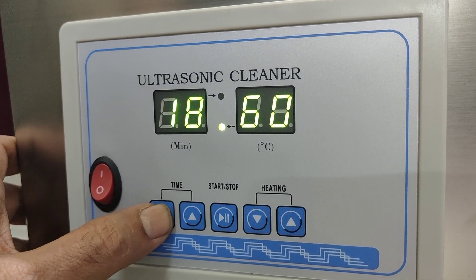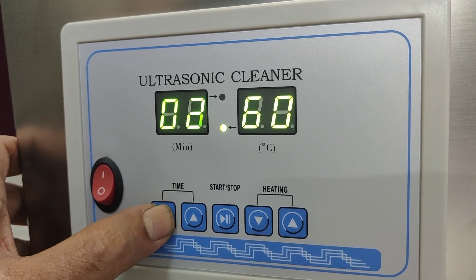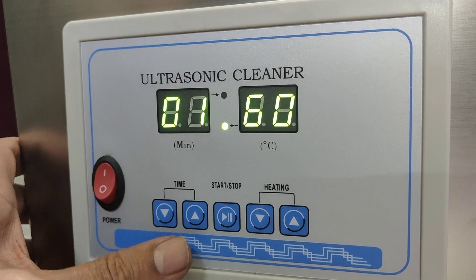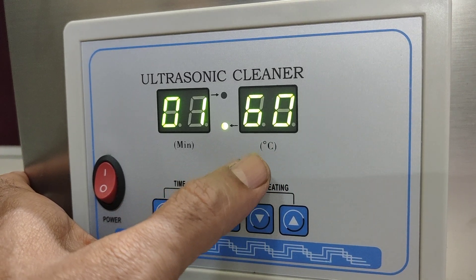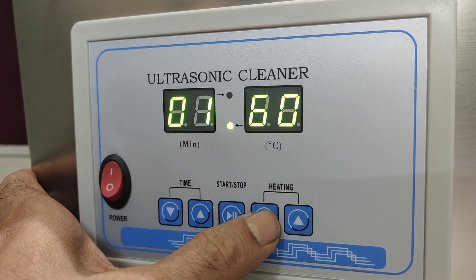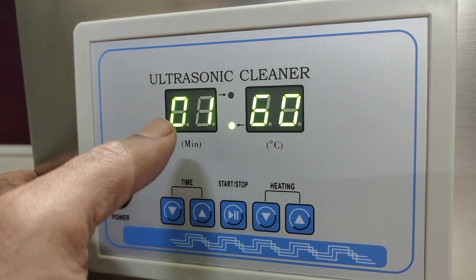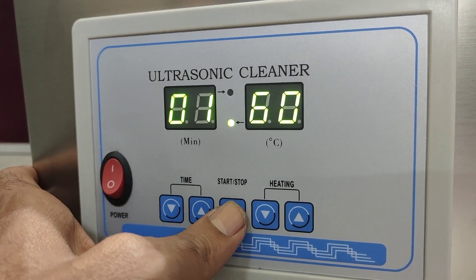For this demo I am giving just one minute. After one minute it will stop. Temperature maximum is 80 degrees centigrade, but here I am setting 60 degrees. You just have to set the time and temperature and then start it.